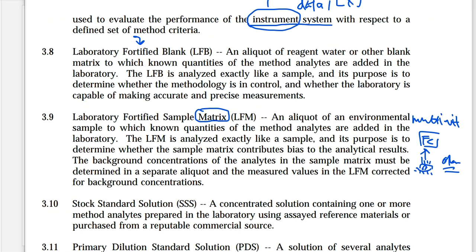The reason I'm doing it is because it has an environmental spin, but it's giving us some definitions that are also used in other facets of the laboratory field. And that's okay, because some of these other organizations might not use every single one of these, but EPA does a pretty good job of embellishing everything as far as quality goes and what is really a good SOP and a good method.